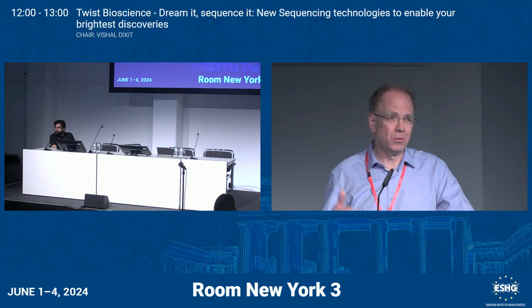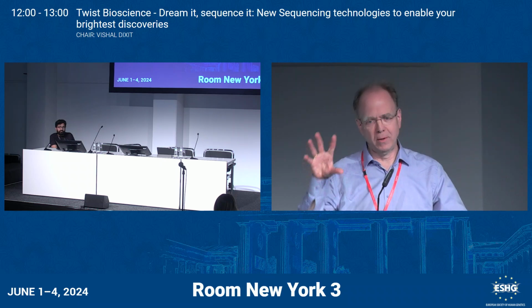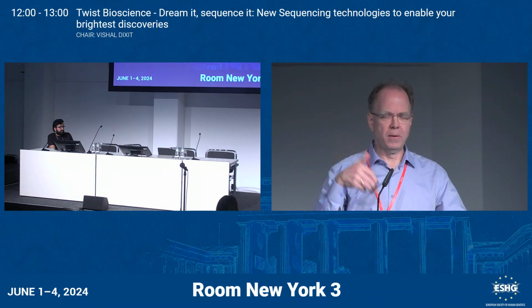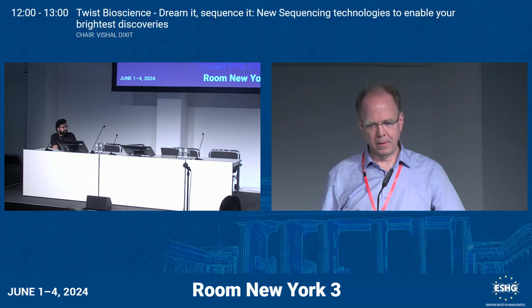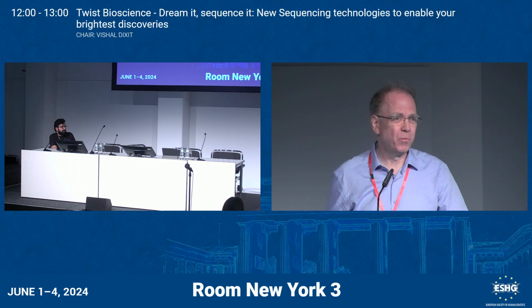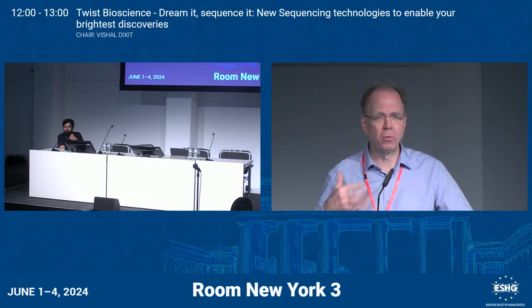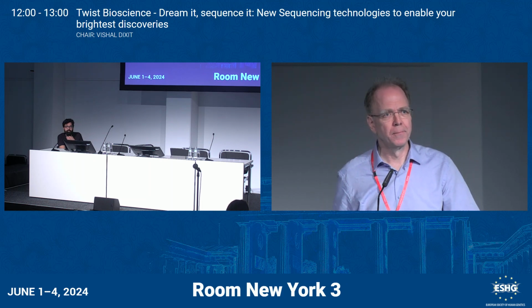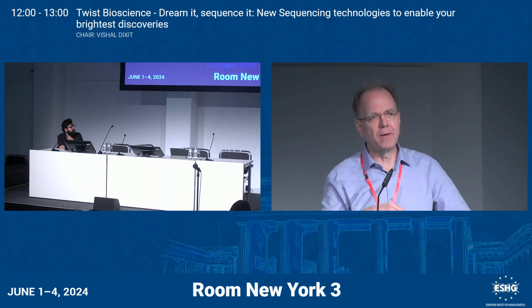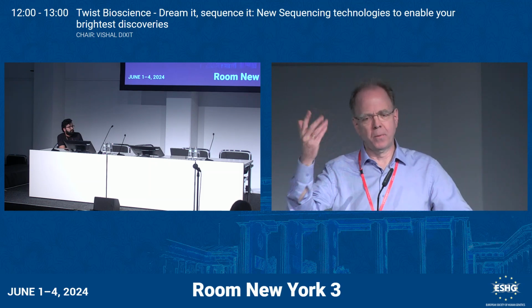We use Gepardo as a laboratory system, and we use basically a collection of different software for different purposes. For the variant visualization, we have IGV and JSI, which are nice. But I think any LIMS would work. There's no specific requirement for the LIMS, I would say. Okay, so it's working all right with the Revio data? With most of the data that were analyzed, the main bulk of the analysis was with the PacBio software portfolio.